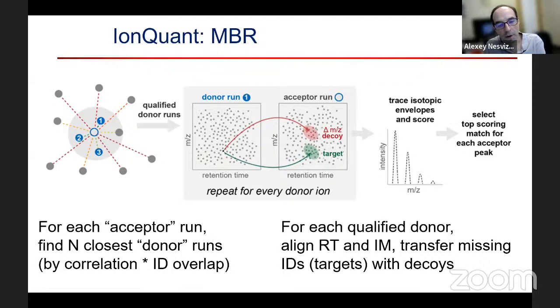Vlad Pityuk worked on that and others. So we referenced this idea in the IonQuant match between runs paper. We shift identified peptides by a certain mass-to-charge ratio to create signals that shouldn't exist. We shift them by, I think, 11 Dalton or 13 Dalton, and try some other shifts. Those mass shifts don't correspond to any common PTM.